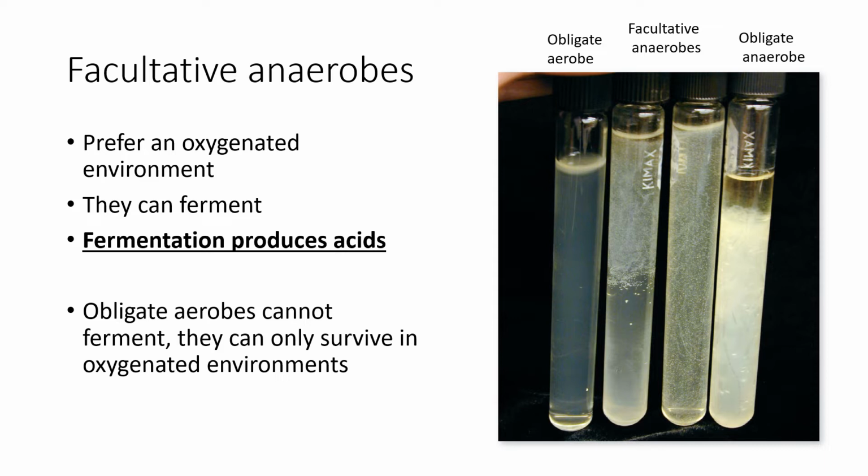They'll just go ahead and ferment. Fermentation produces acids. We looked at that table before. I asked you to know one organism and its final product from fermentation. And for many of you, you chose some acid or other. Some of you chose other things, but nevertheless, fermentation will produce acids. That's one of the things that we know.